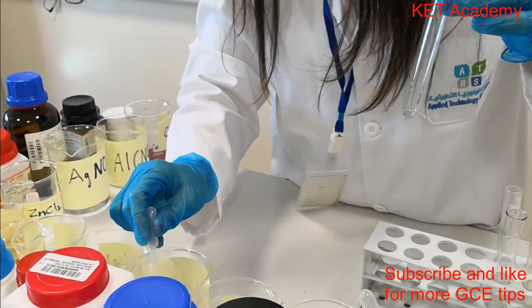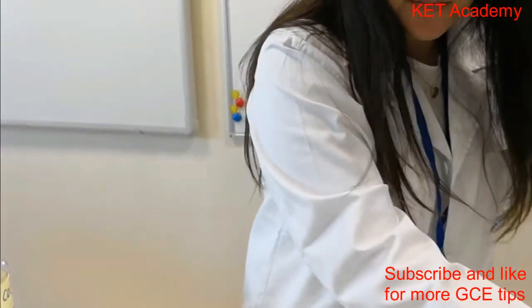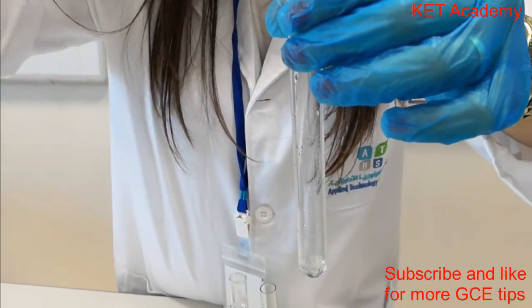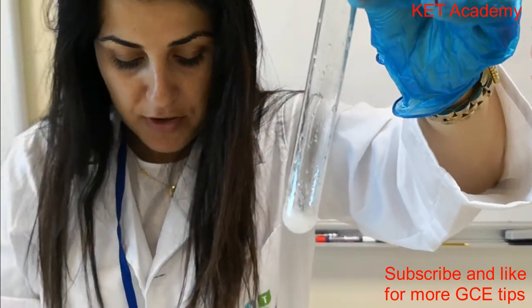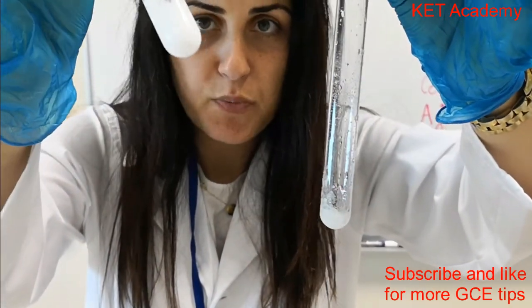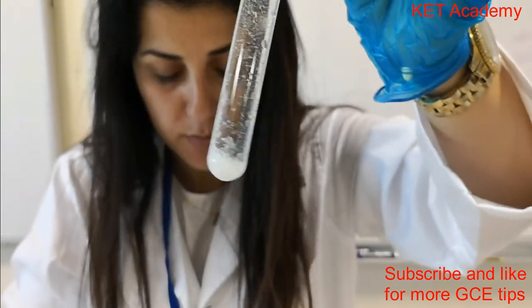Let's take the magnesium. This is magnesium, and this is hydroxide. Now if I compare the calcium and the magnesium, the magnesium is brighter. The magnesium makes a gelatinous white precipitate.